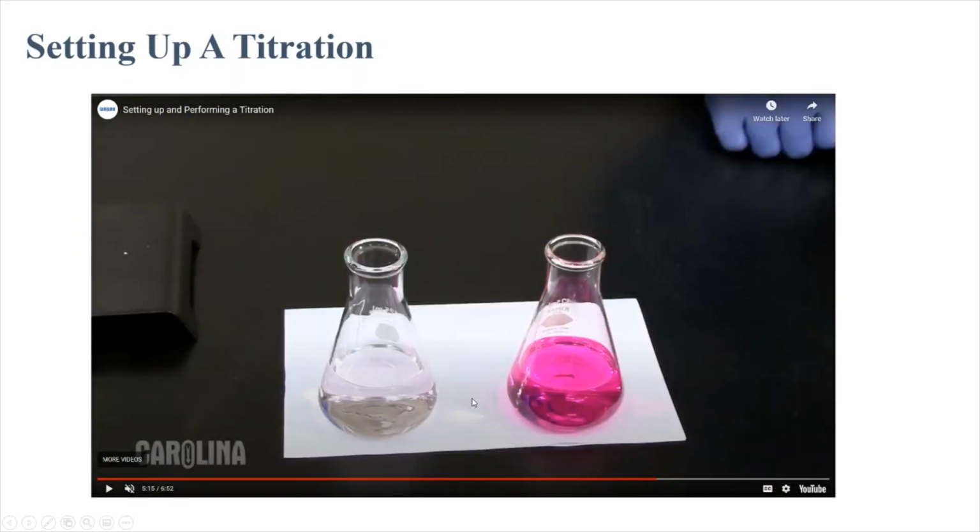So these are the solutions. This solution has gone well past the endpoint, way too pink. This solution is almost perfect. There's a teeny bit of pink that you can see looking through that solution. It's almost clear or colorless, but there's a teeny little bit of pink. That means you've hit it right on the nose, right?